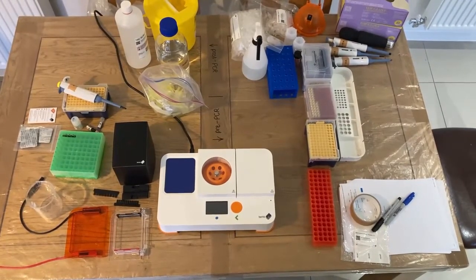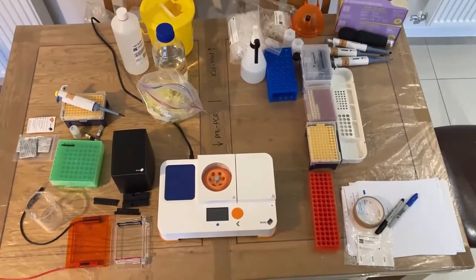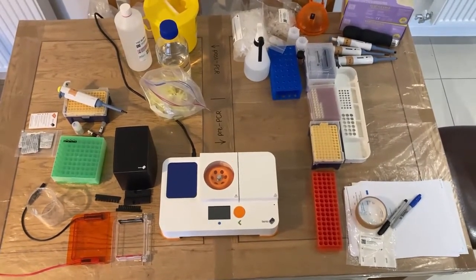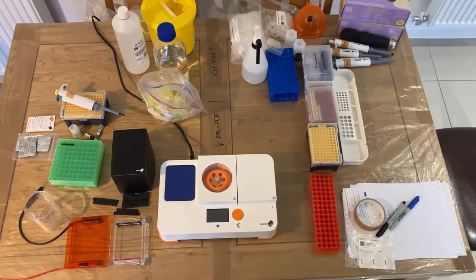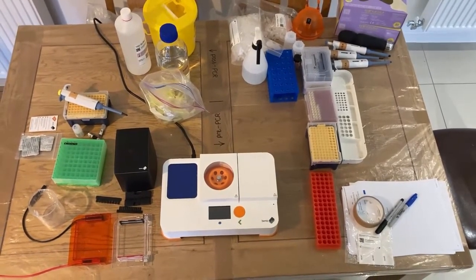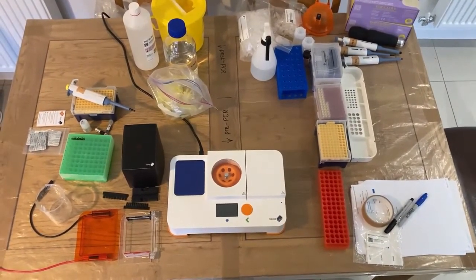To give you an aerial view of the lab setup: I'm on my kitchen table, standing on a kitchen chair. I've covered the kitchen table in a plastic sheet just to make it easier to wipe down and disinfect between experiments. The right-hand side of the table is for pre-PCR work — extracting DNA from my samples prior to them going into the PCR machine. Then I have my Bento Lab neatly straddling both sides, and on the left-hand side I have my post-PCR product.